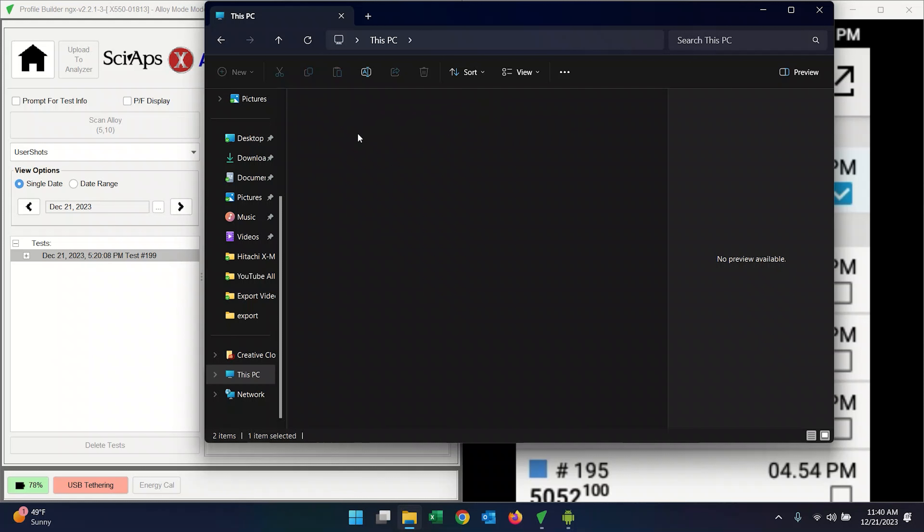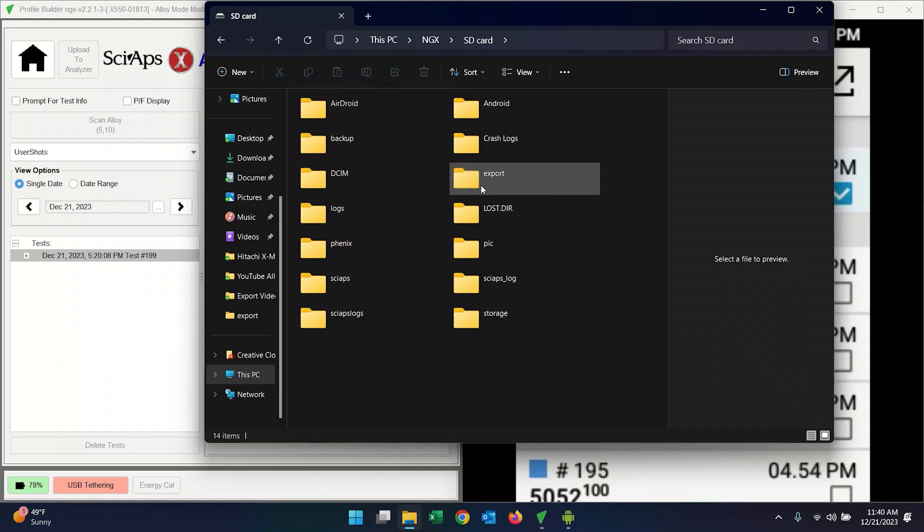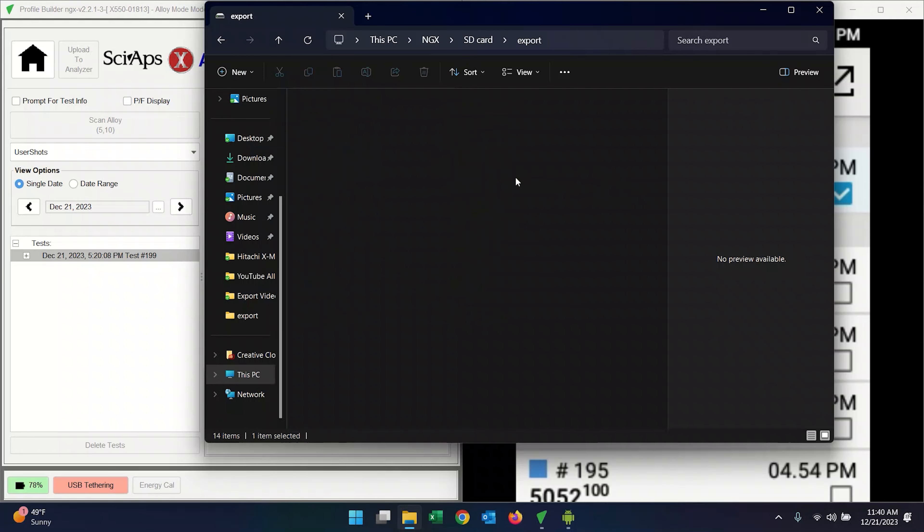But you're going to go to my PC and the drive you're going to open is called NGX. If you double click that, you're going to get the SD card that's on the device itself and you're going to get a list of folders. And it's going to seem intimidating at first because there's a lot of folders here. We just care about what we exported. So find the export folder and open that.